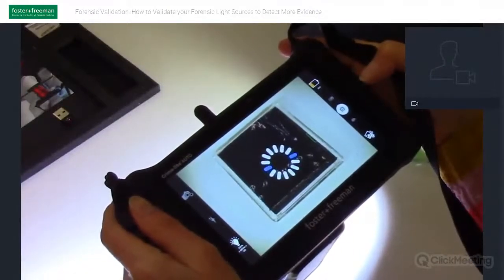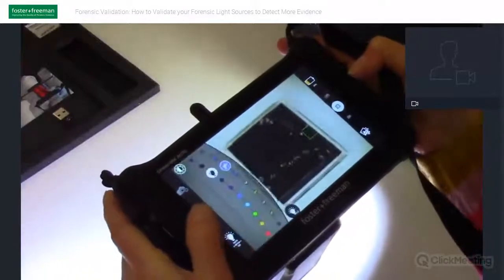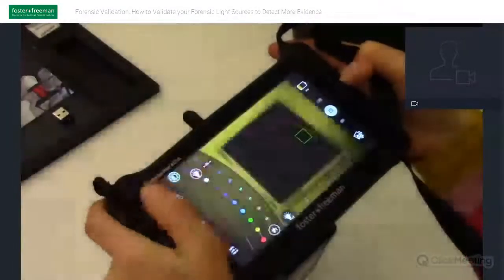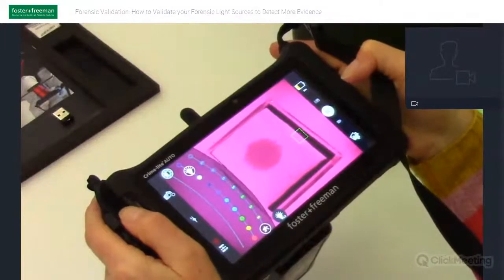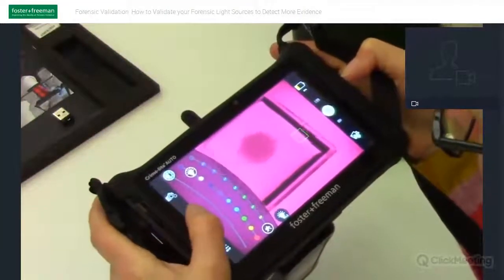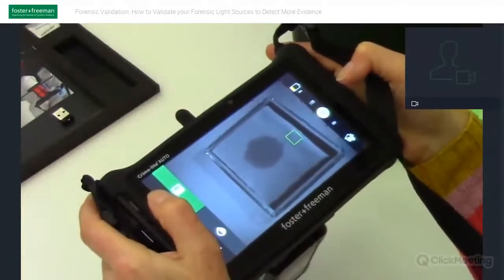Using a technique known as reflected infrared, we can now visualize the blood as it is absorbed, and the background reflects the infrared and looks white, and the blood absorbs and looks dark. We can also use the inverse to get a nice dark sample.